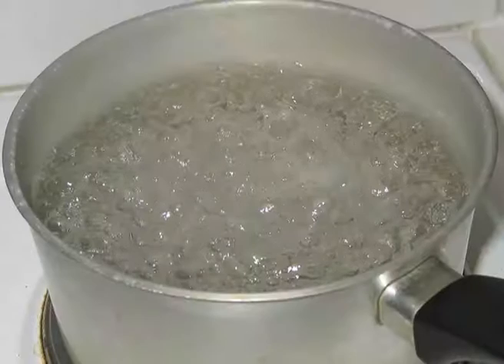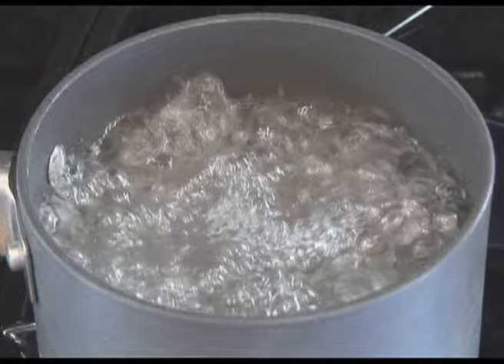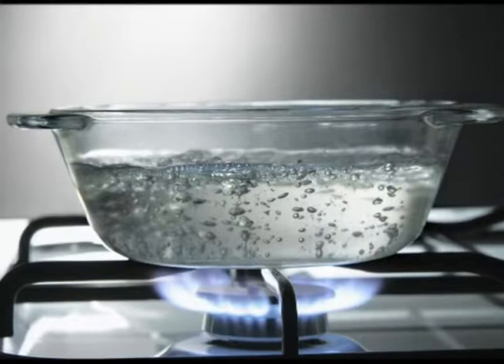It has been a method from ancient days that people know that anything we want to sterilize, if it is boiled in water, then it undergoes perfect sterilization. So, 10 minutes of boiling is enough to kill the viable microorganisms. But this time is not sufficient to take care of the endospores. So, we need to increase the duration up to 30 minutes.